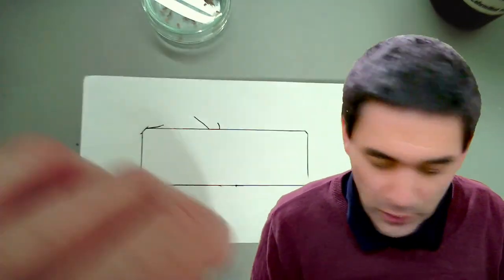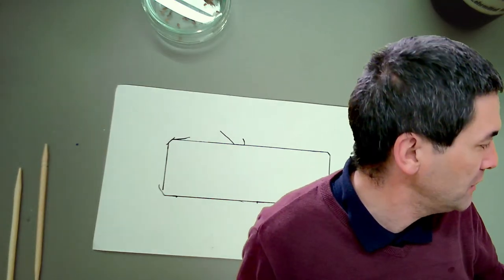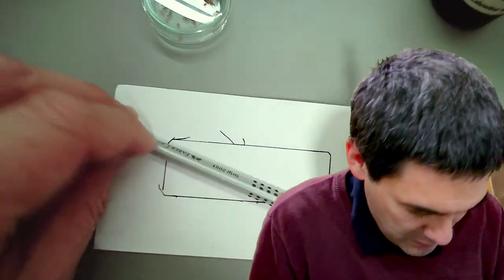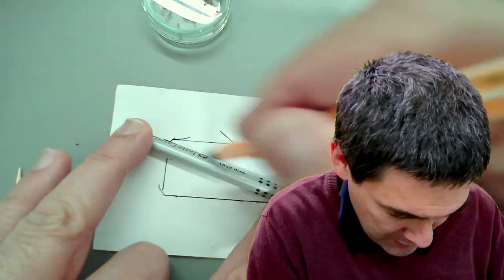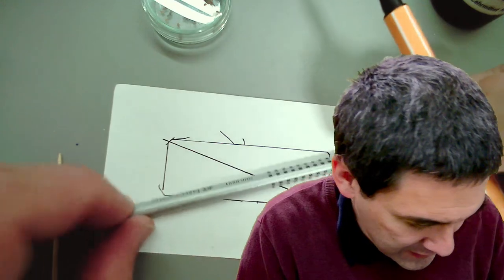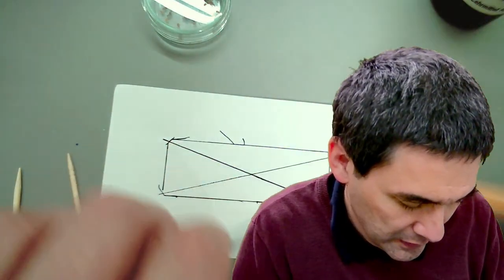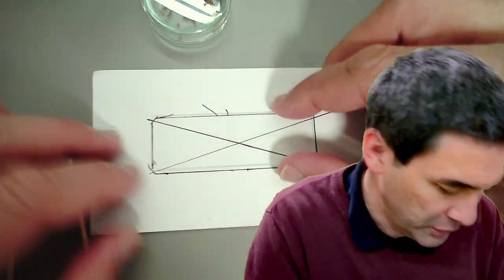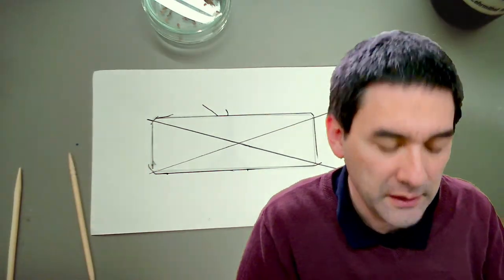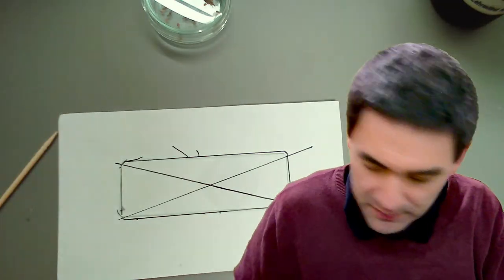Okay, let's do it like this. Do I have a ruler somewhere? I don't know. Some kind of a straight edge. I'll just use a pencil. Okay. I think you get the idea, because I want to have slides that look a little bit regular, and a little bit more reproducible, and I just put it on here, and I basically now know where the middle is, and this is where I'll be working. So that's something that I sometimes like to do.